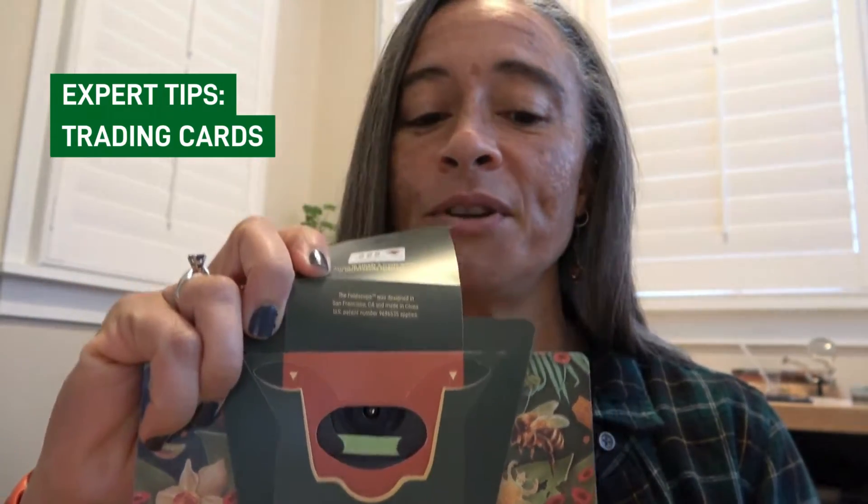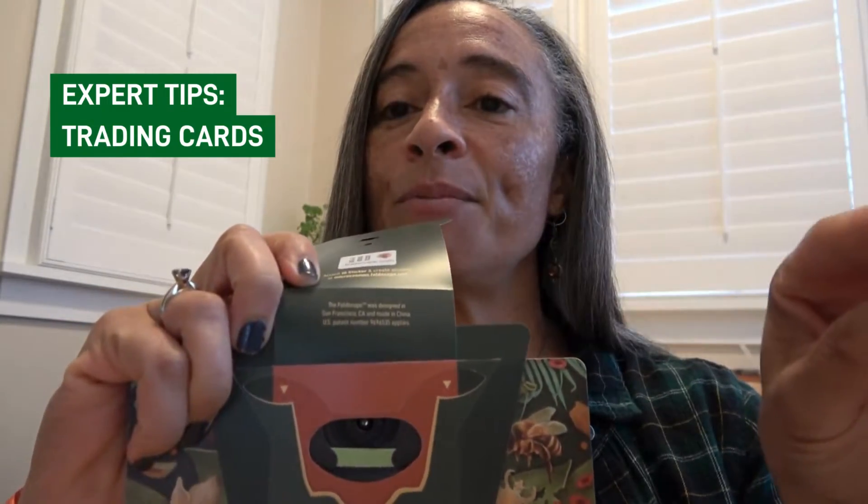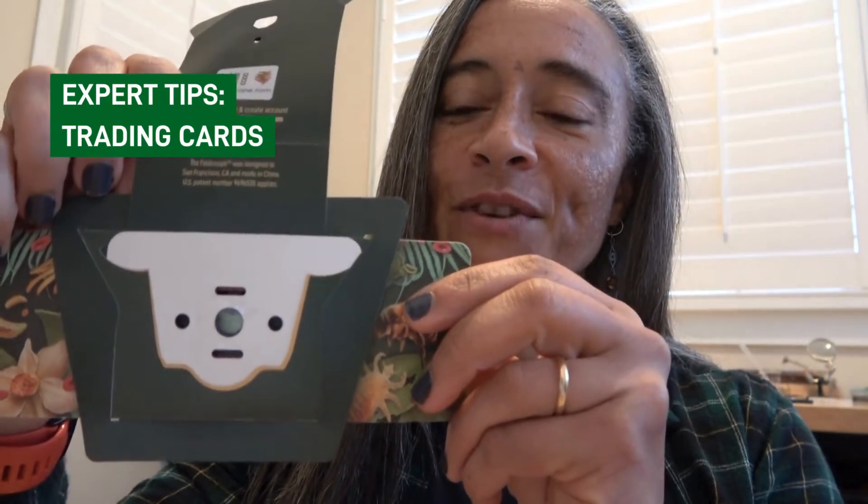Once you have your sample in your trading card, you are going to open up the back of your Foldscope 2.0 and then you're going to use those two arrows there that show you where to put your sample. When you put your sample in, make sure that your sample is facing the lens. You go ahead and just place it into the Foldscope. Once it is in place, you should have what I consider a cute little koala face on the back of your Foldscope. Close the back and you should hear the snap of the magnet locking it into place.